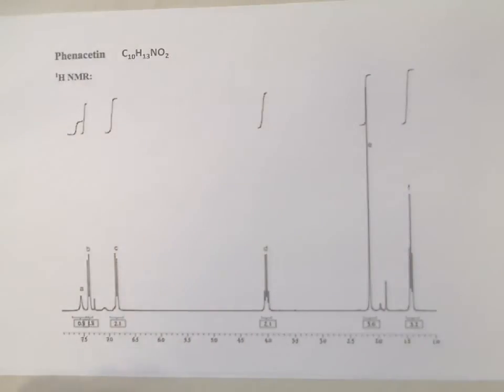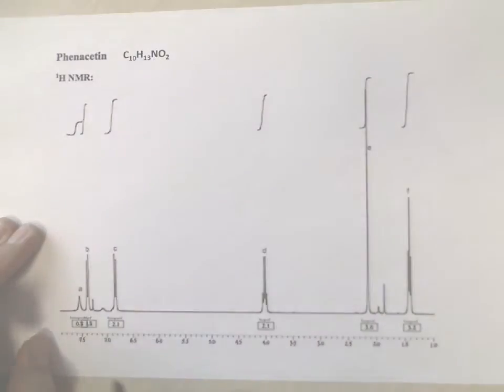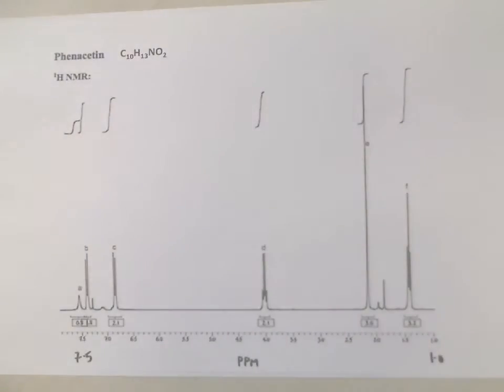Now we know it's an NMR spectrum because, as well as being told that at the top, notice the range across the bottom, although it's a little difficult to see, goes from 1 up to 7.5 ppm, at least on this scale. It's been cropped down slightly.